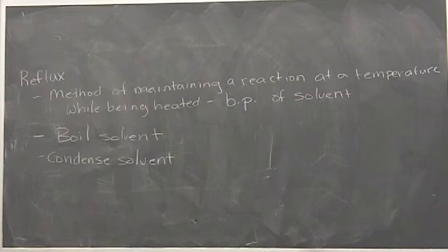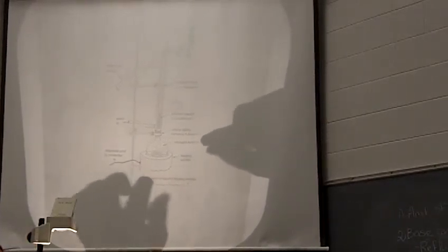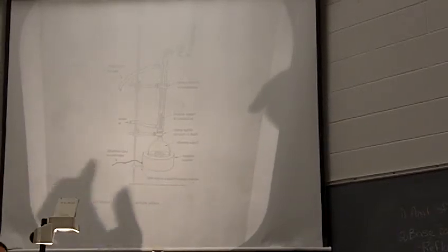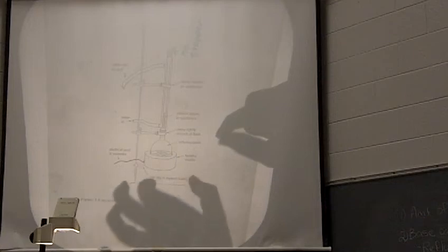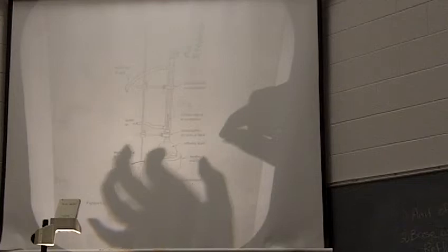So in your lab manual is our basic setup for a reflux. All right? And we're going to set it up. It shows it set up on an iron ring. We have stir plates in all the hoods. So we're just going to put our stir plate on top of the ring stand, on the plate of the ring stand.